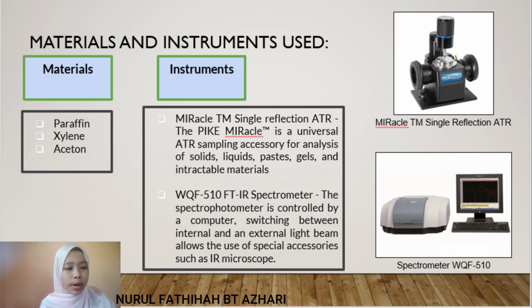The spectrophotometer is controlled by a computer. Switching between an internal and an external light beam allows the use of special accessories such as an IR microscope. Here, there are two pictures of the MIRacle Single Reflection ATR and the spectrometer WQF 510.